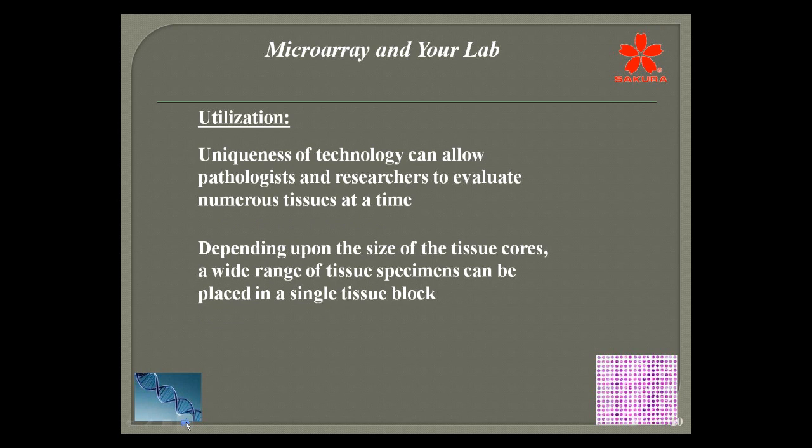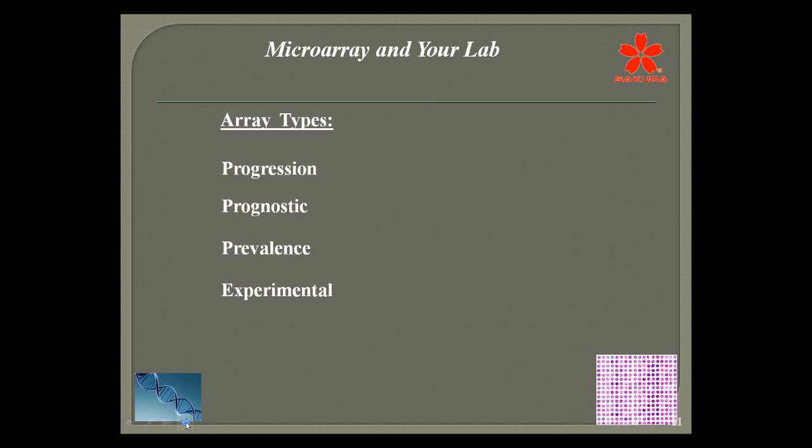Utilization: the uniqueness of technology can allow pathologists and researchers to evaluate numerous tissues at one time. And depending upon the size of the tissue cores, certainly a wide range of these tissue specimens can be placed in a single tissue block.